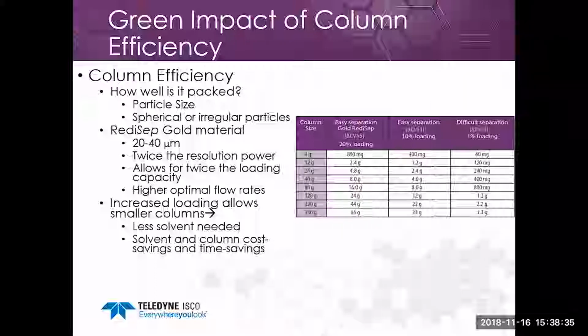So here's the default loading guide that we offer for our columns. On the left there, we have our column size.